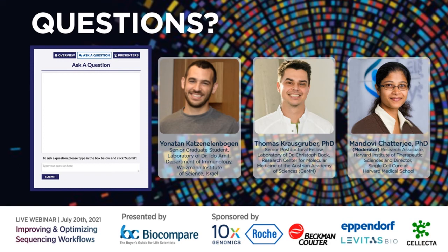Moving on to the next question. How do you decide which technique to go with, single versus bulk sequencing? And is there a decision tree that can guide you, Thomas?